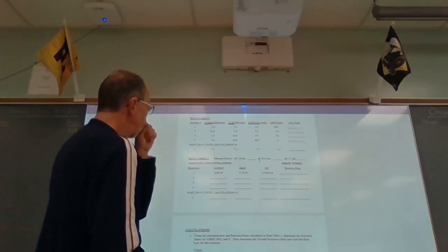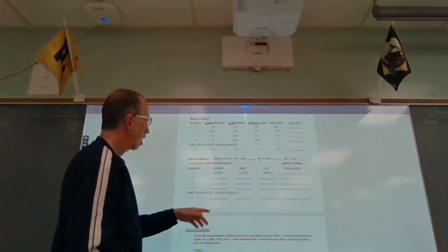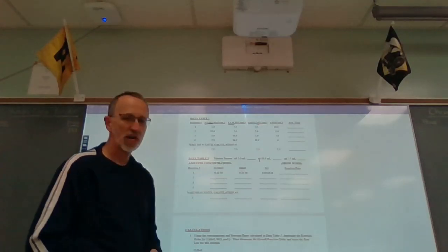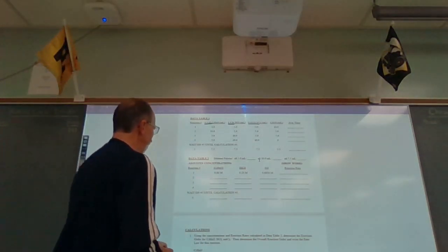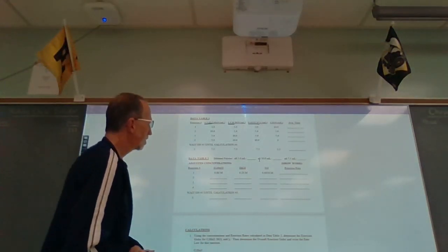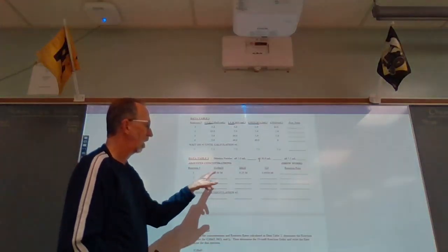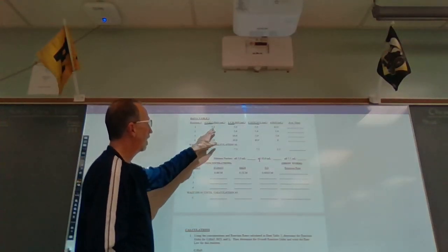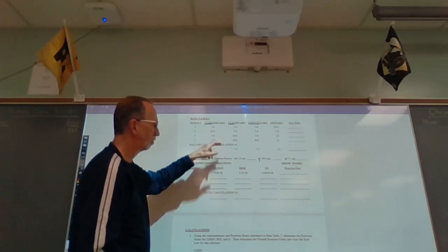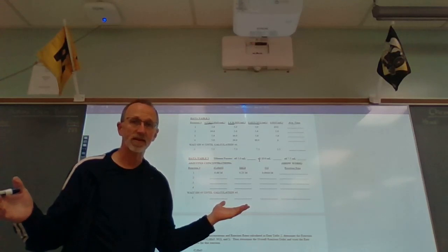Now, in data table 2, which is the important one, it talks about adjusted concentrations, all right? Adjusted concentrations. Here is why that says that. So I already have some numbers written in here, and I want to explain where those come from. So let's look at this. Here we have 5 mLs of acetone, and that is just acetone. There's acetone particles in there and nothing else.